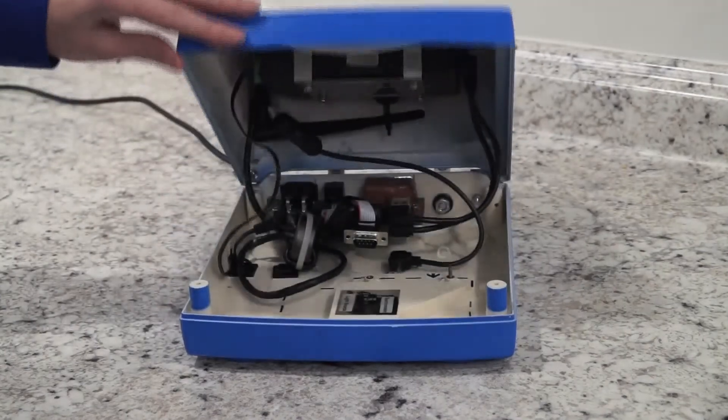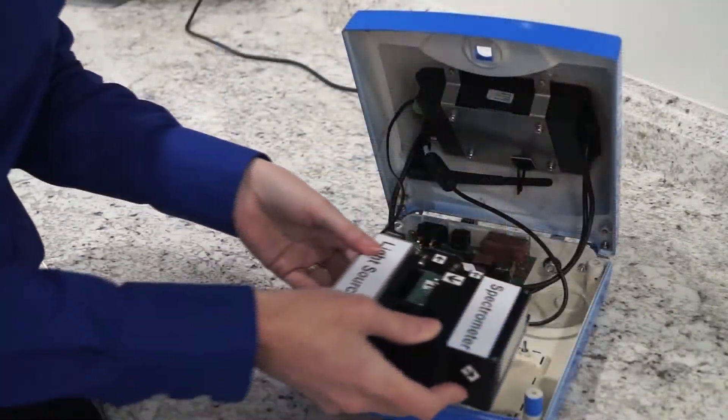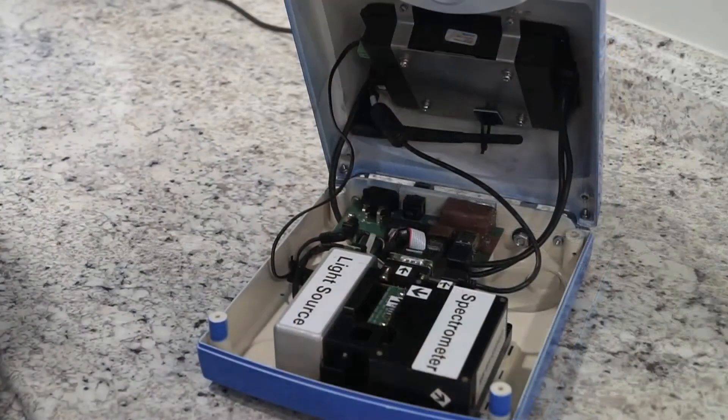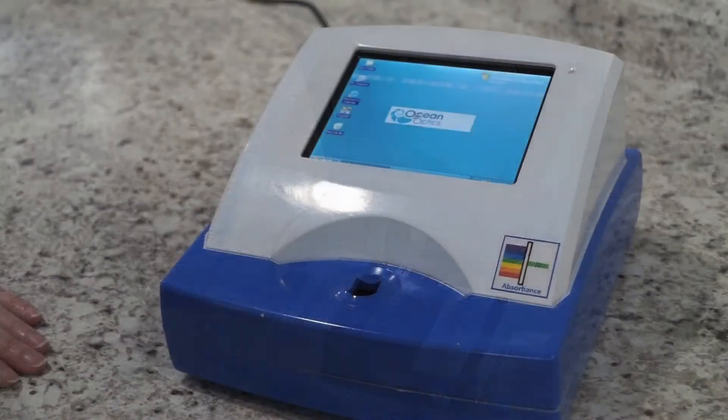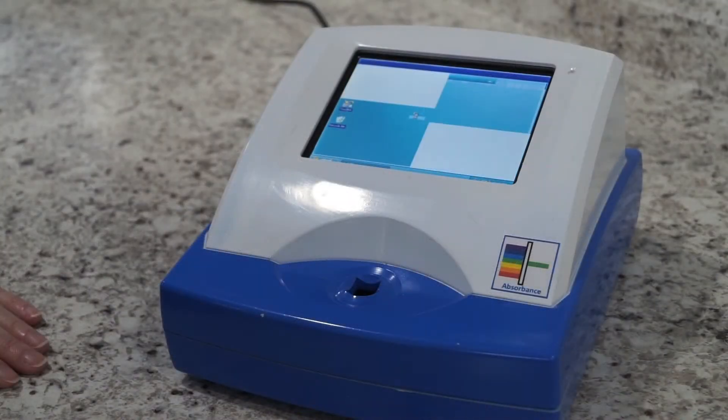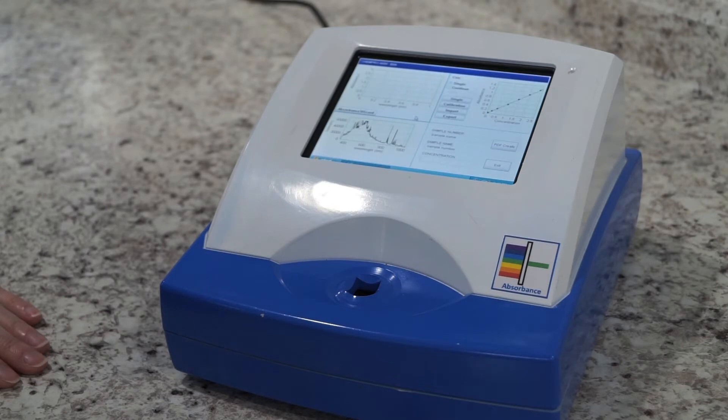At the next level of integration, a CCA is added to control the light source and spectrometer. This can be customized to include Wi-Fi or Ethernet for remote communication. Additionally, thermistors and fans may be included for temperature control.